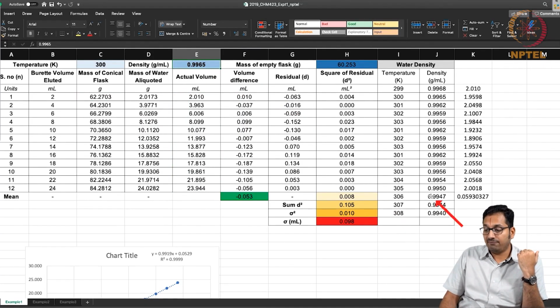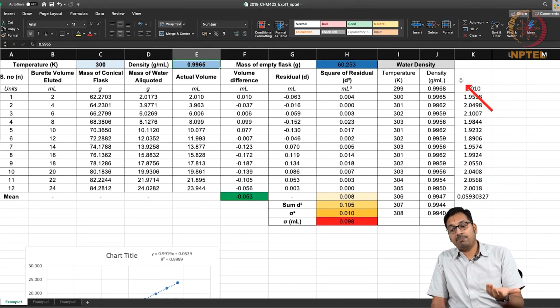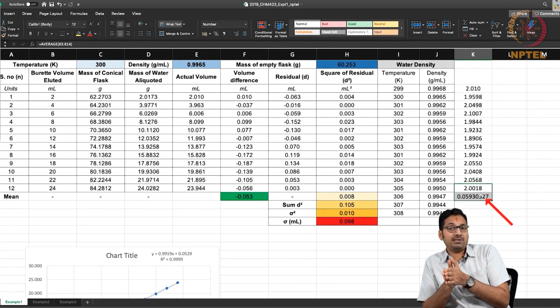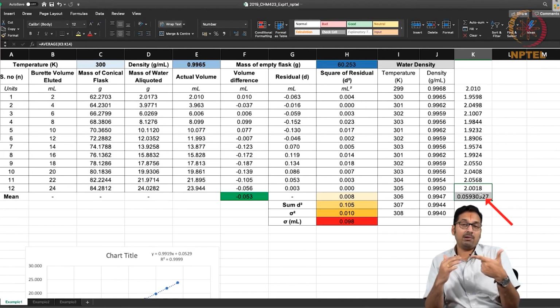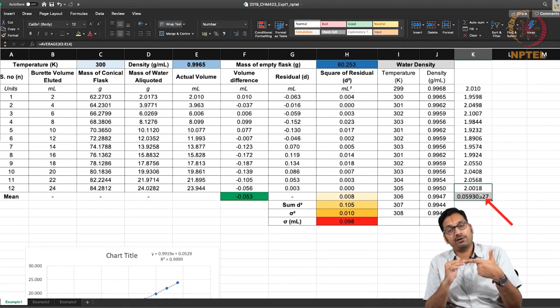And finally, as you are copy pasting, you might end up making some mistakes which result in erroneous measurements. Luckily, that is personal error, and that will end up giving a gross mistake in the measurement, so you would be able to pick up what is a gross error. On the other hand, systematic errors would come up if you are having all values above or below a certain value that you are trying to measure.